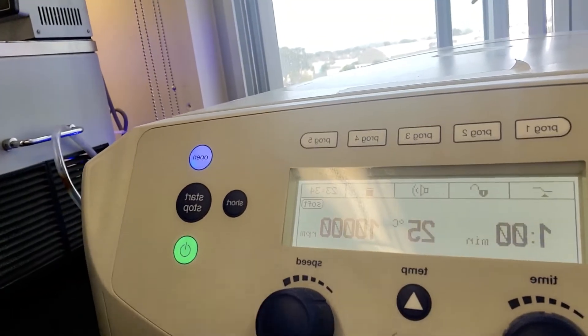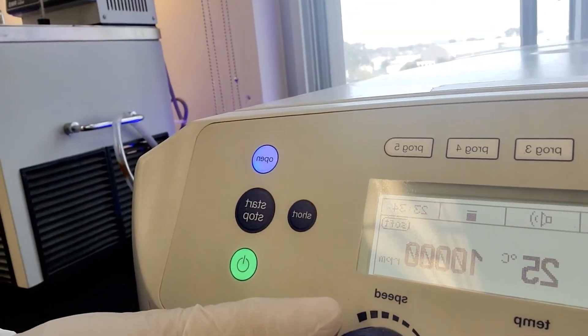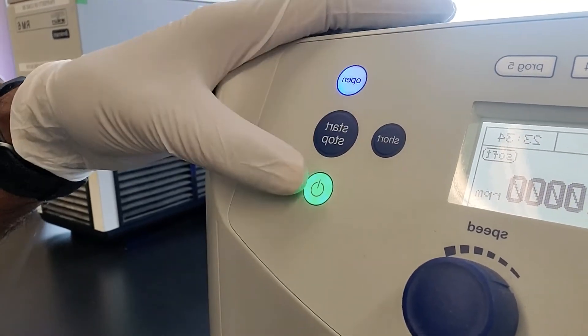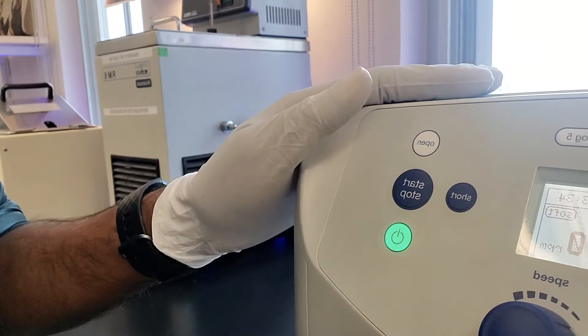I'm going to set my dials. This is my minute dial here and this is my speed dial here. It's set for one minute at 25°C right now, and then I'm going to start it.